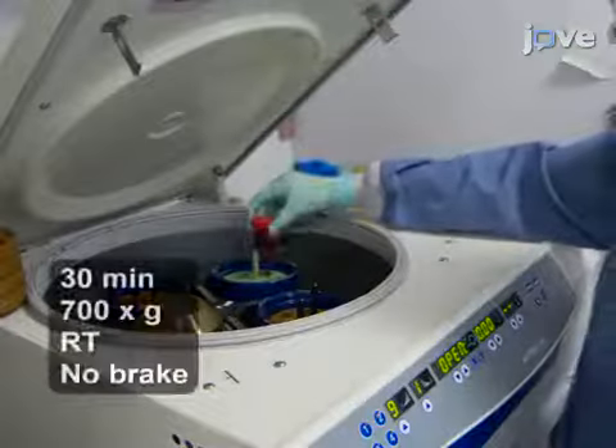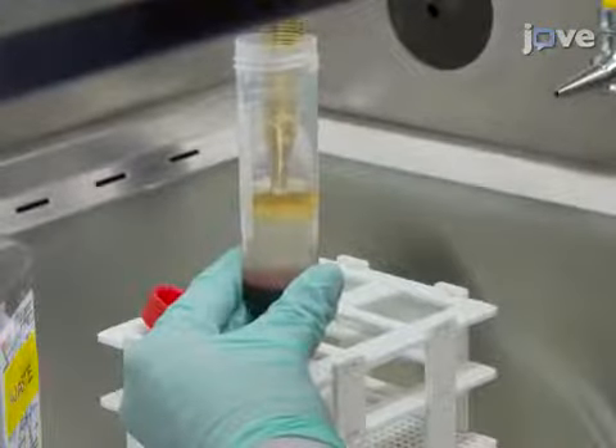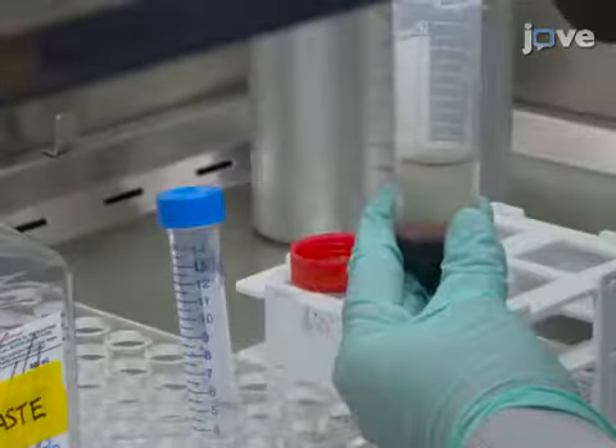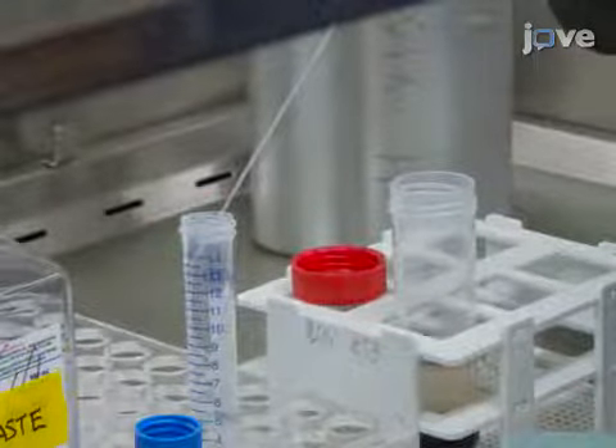Separate the cells by centrifugation. Then discard the top plasma layer and use a glass pasture pipette to transfer the PBMC-containing buffy coat into a new 15-milliliter tube.